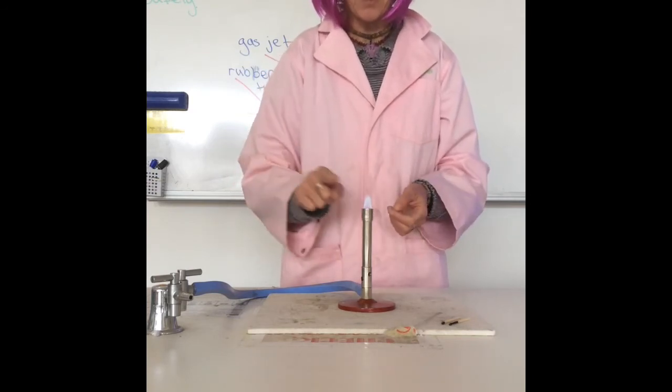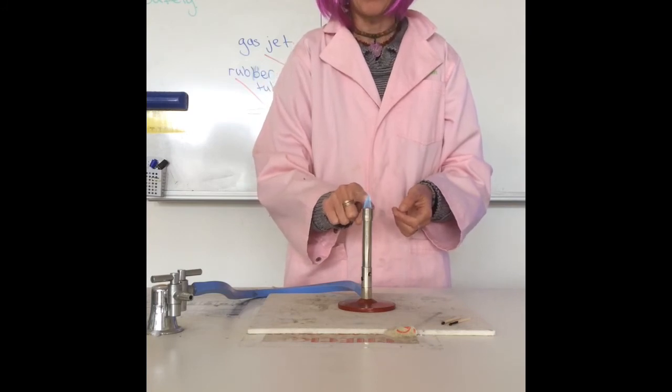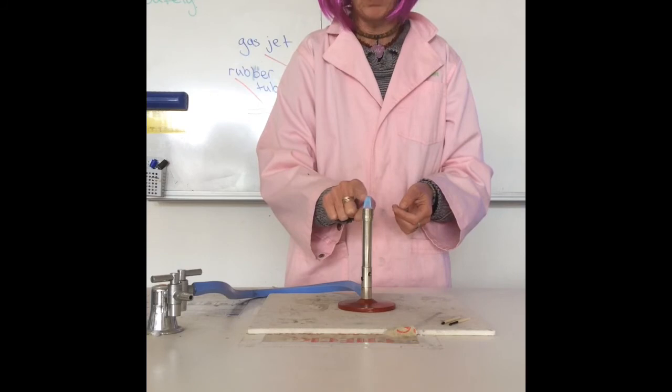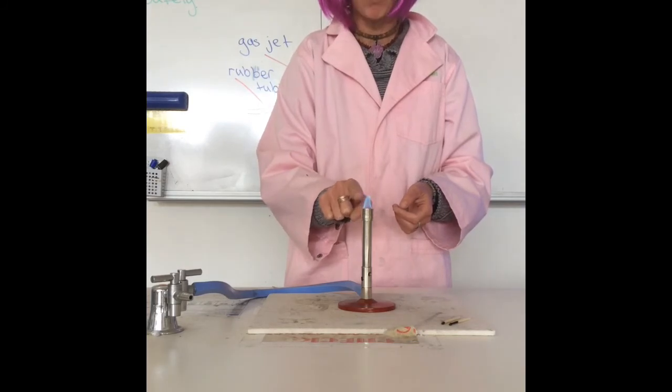The hottest part of the blue flame, if you can see, might look like I've got my finger in the flame. I don't. It's the top of that little blue flame that you can see. That's the hottest part.